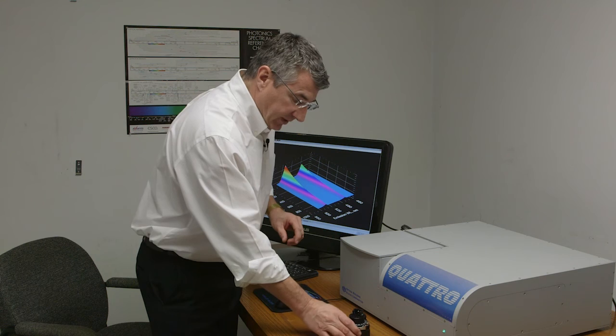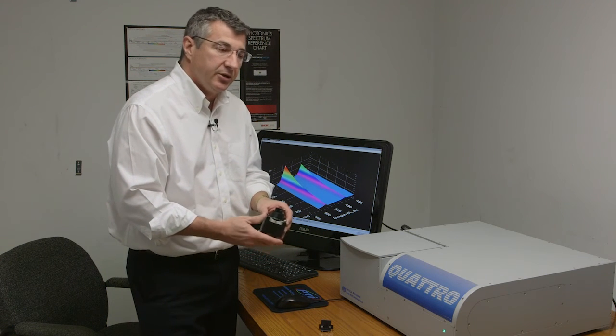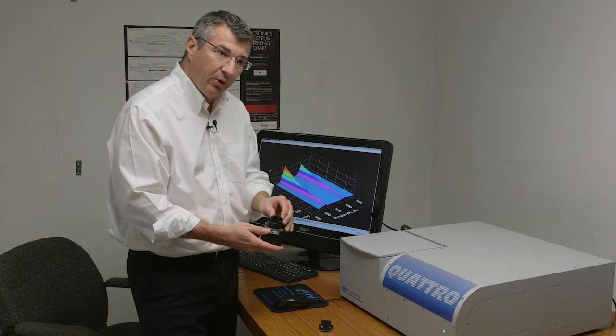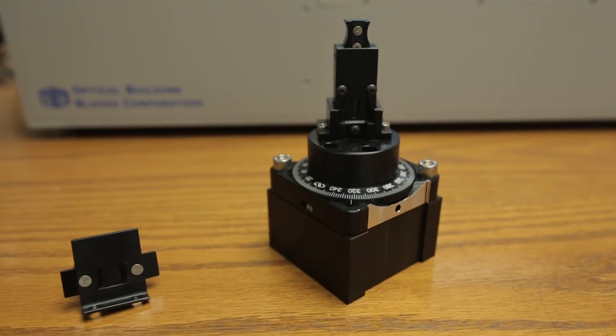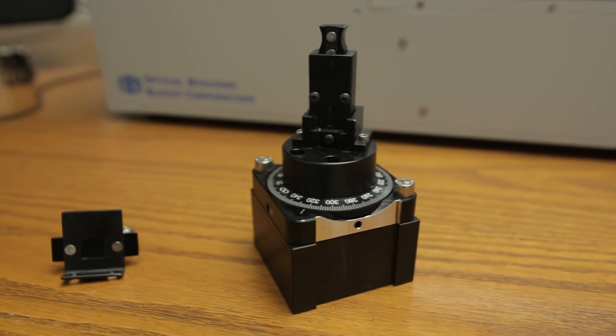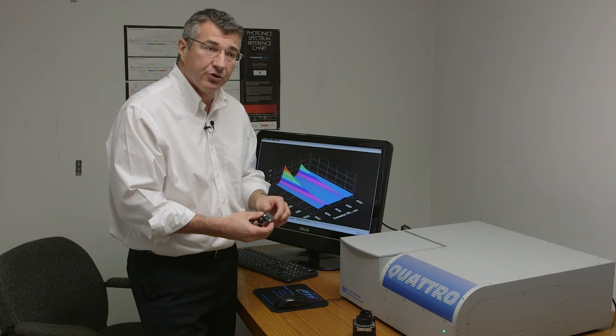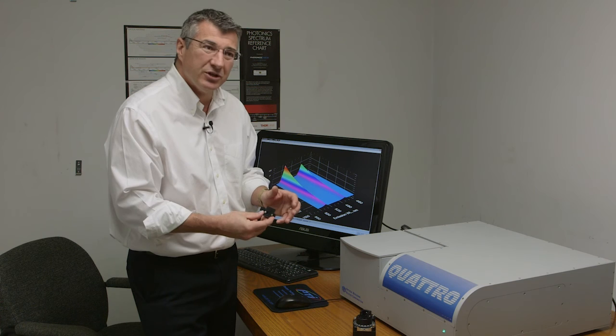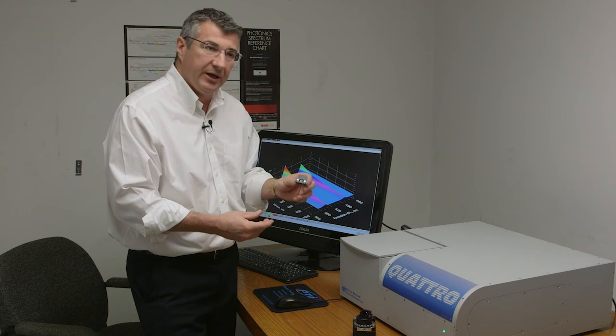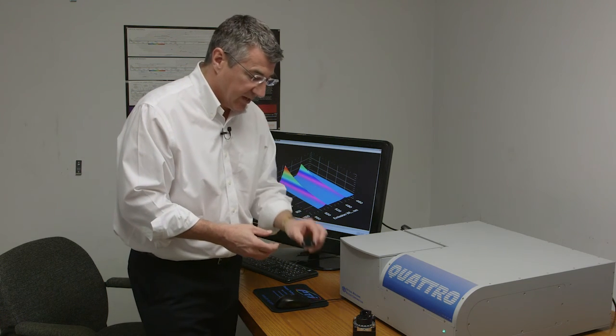We also have sample holders for working with various kinds of solids, so we have a powder sample holder accessory and a solid sample holder accessory, so you can pretty much work with any kind of a film, flat surface, irregular surface, powders, cover slip based samples, virtually anything else can be adjusted, looked at with these.